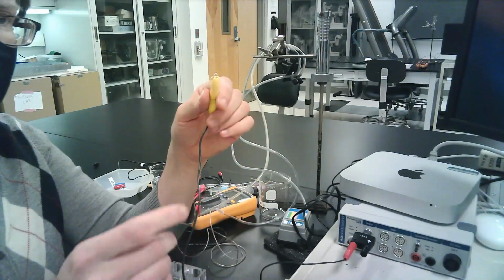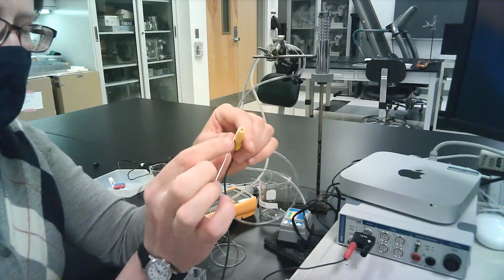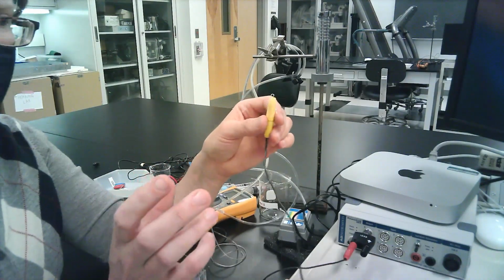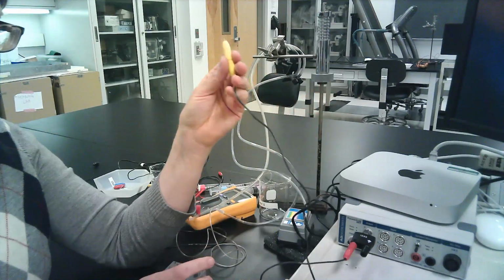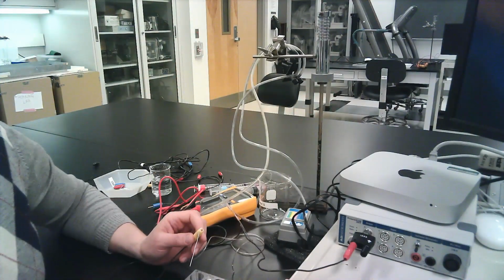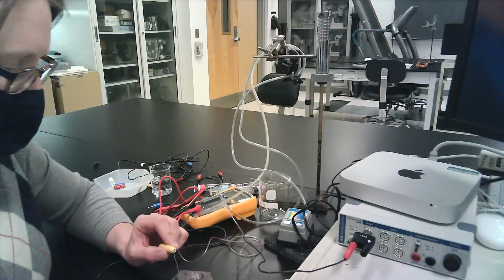For the actual lab, this is going to go into a glass capillary tube that has a salt solution in it, but for this demo right now, I'm just going to leave it as it is. This is then going to go into one half of your chamber, specifically onto the serosal side of the chamber.